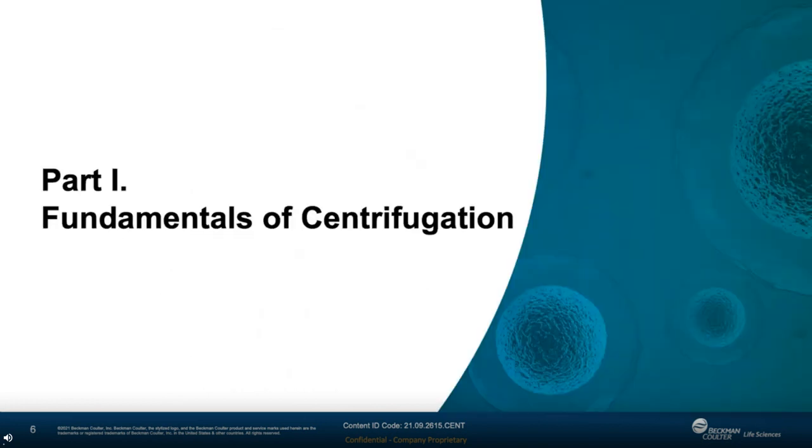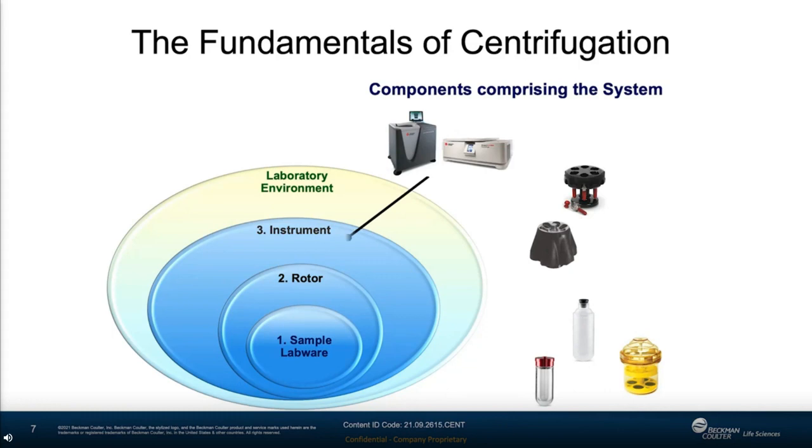The first part of the talk includes fundamentals of centrifugation. Lab centrifuges are not used in isolation. If we work our way out from the center of this diagram, samples are held in tubes or other containers that have to be selected based upon the appropriate rotor for the application. The centrifuge itself is located within the lab environment, and all of these choices, from the tube selected to the management of the laboratory, can have consequences for safety.